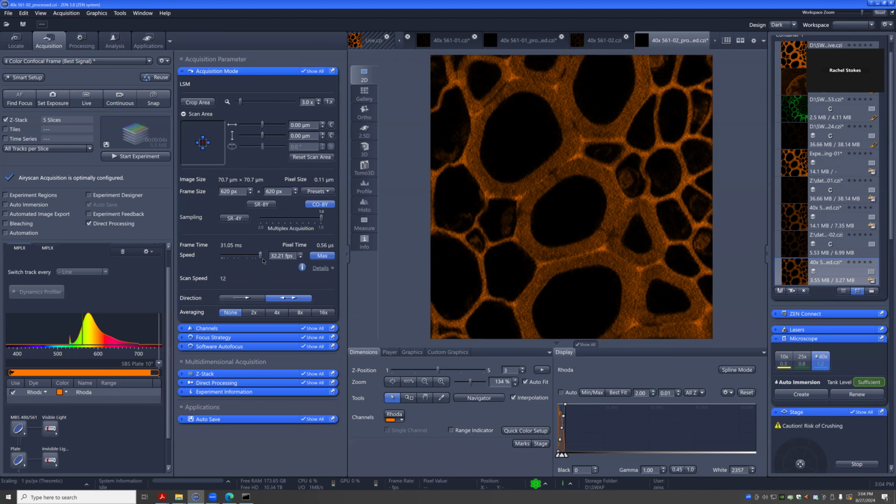And again, you can improve this a bit, right? Here, say 30 milliseconds, really fast, right? But you can always say, okay, let's go a little slower, add a little more laser power to get a little more signal to noise. You can even choose one of these in-between modes, like SR8Y. You can see this is more pixels, so higher resolution. It goes from 30 milliseconds to 62 milliseconds, which is still really fast, but you'll get a higher resolution image. So these are all parameters that you can play with for the faster mode of the area scan.